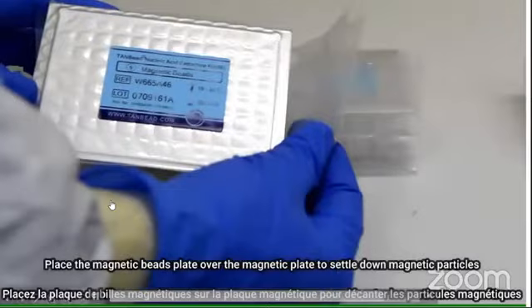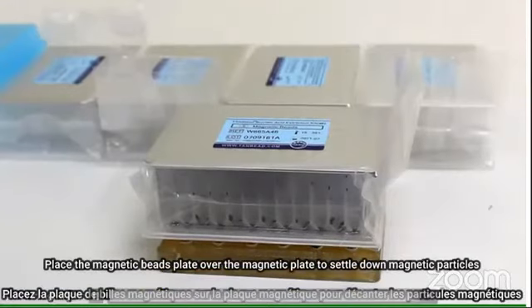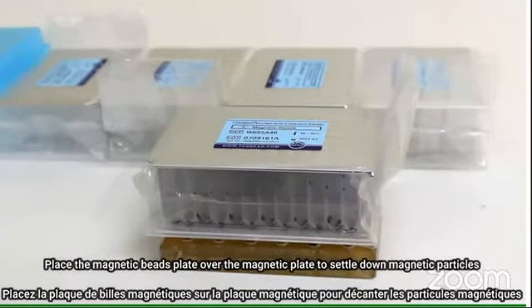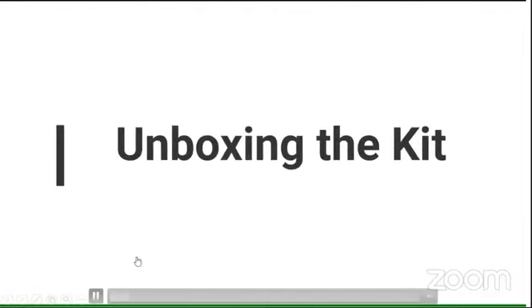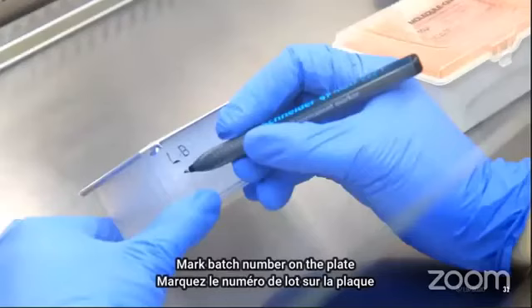This is the magnetic bead plate, and we can place the deep well plate on the magnetic plate to settle down all the magnetic particles. Now, before starting the experiment, mark the batch number on the plate.